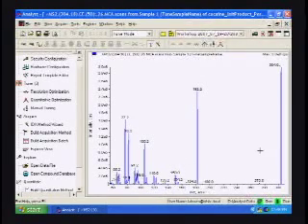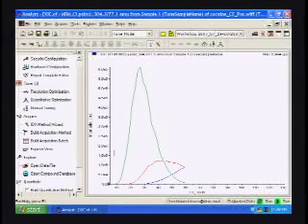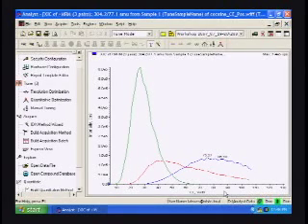Now, the data that it collects in these various panes while it's going through the quantitative optimization, it stores in various folders on the hard drive. So all of this data is accessible in other places, not just here. On this pane, you can see it's got various transitions that it's performing the optimization on, which is why we've got 3 different colored transitions.